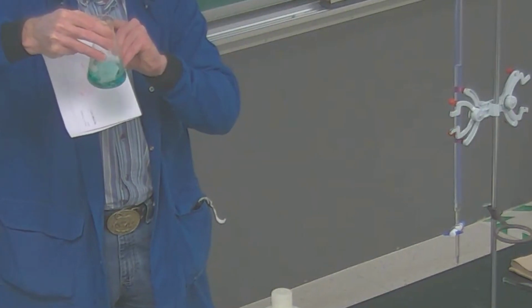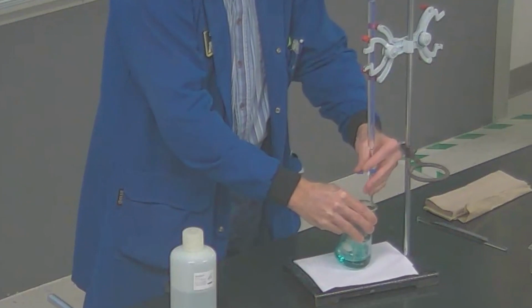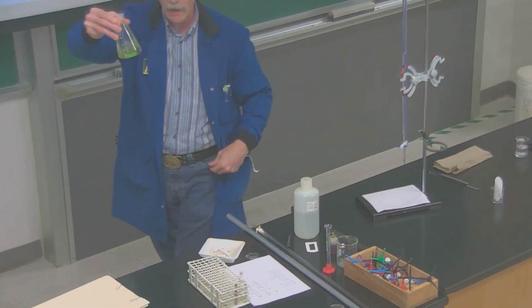It is going back a little bit, might need one more drop, but this is what you're looking for. If you get this, you're there. If you over titrate a little bit, I'm going to go ahead and add excess. You go to this yellow color.